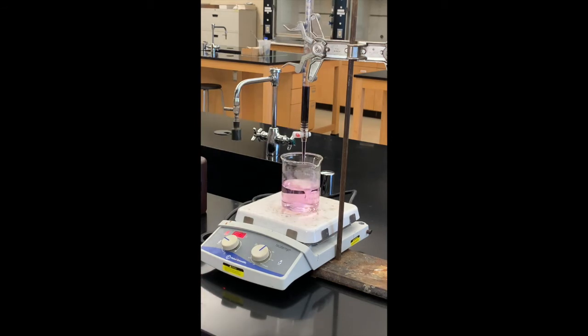We do have that pink color in our solution and it does not seem to be going away. I'm going to go ahead and turn stirring off and the hot plate off, then read the burette. I'll probably move the burette so I can see it a little bit better, and then we'll come back with the third trial.